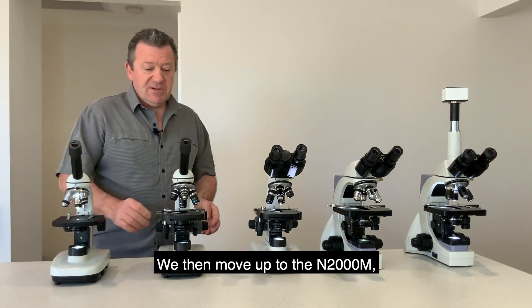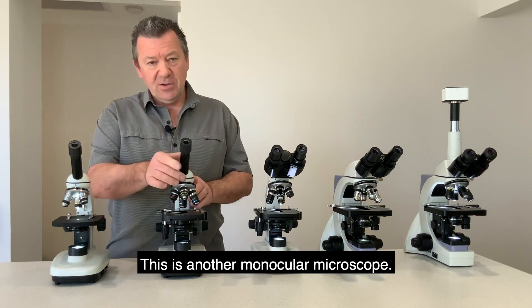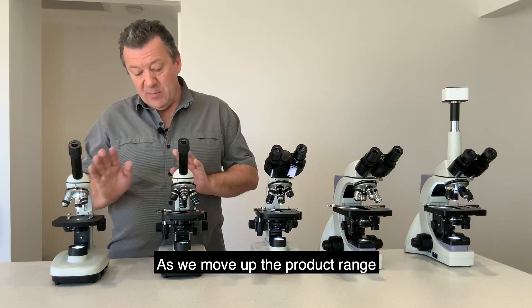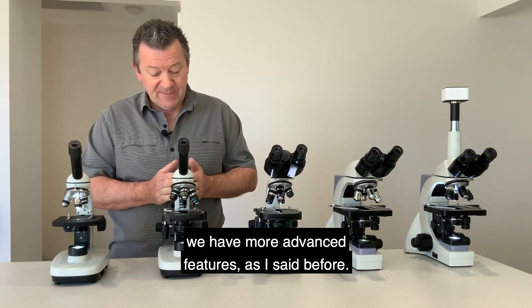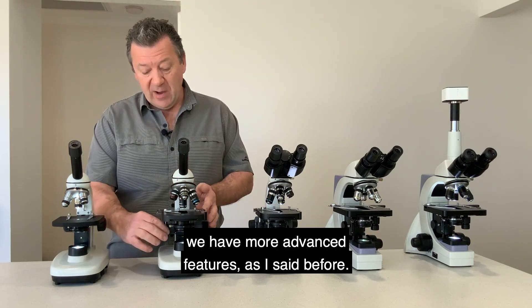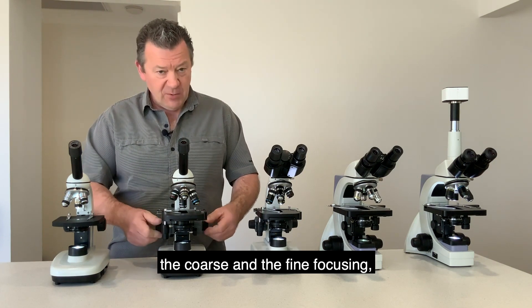We then move up to the N2000M. This is another monocular microscope and as we move up the product range we have more advanced features — including the mechanical stage and the coarse and fine focusing.